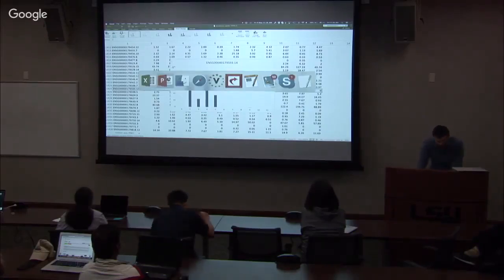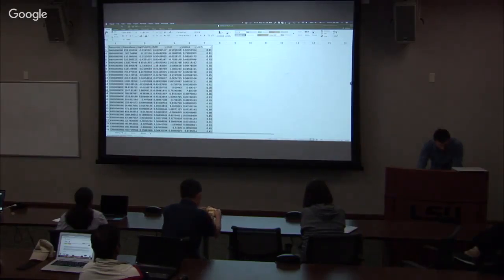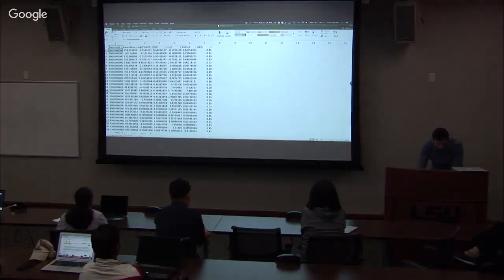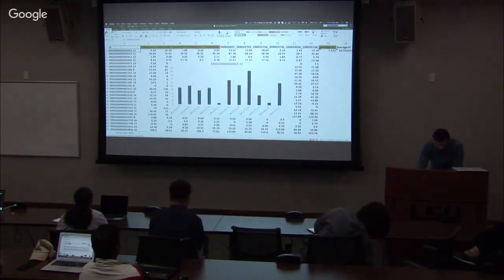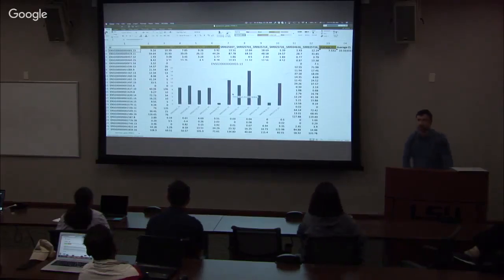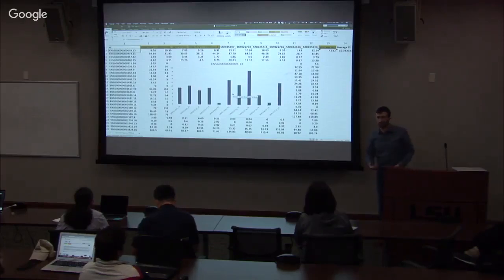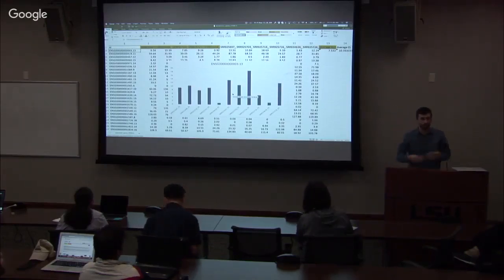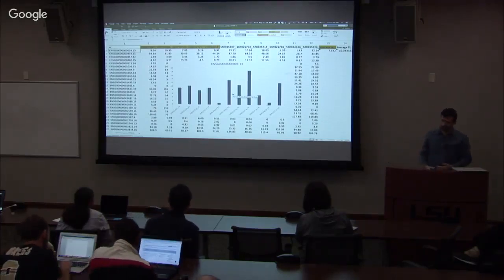If we select a gene that does not have a good p-value, so if we actually take something like this, right, that does not have a good p-value, and we search for that, it was this one, right? So now I see the difference. The difference in these differentially expressed genes would be that on average, within this group, there is a significance and there is a quantifiable difference.